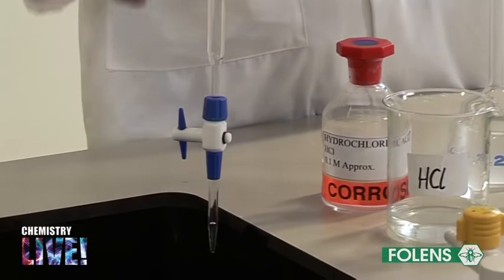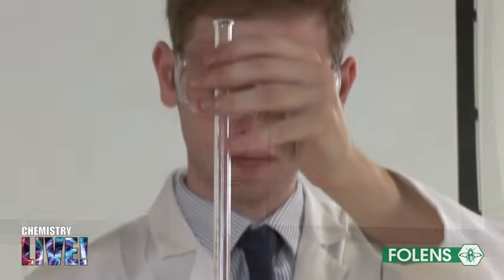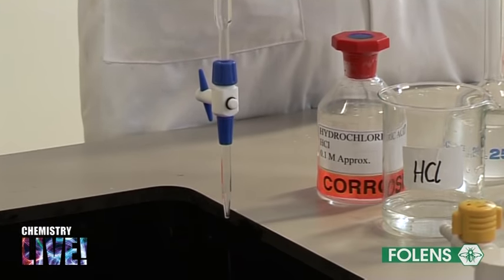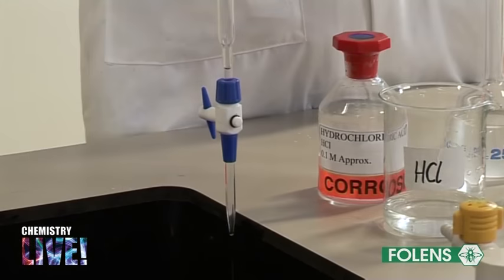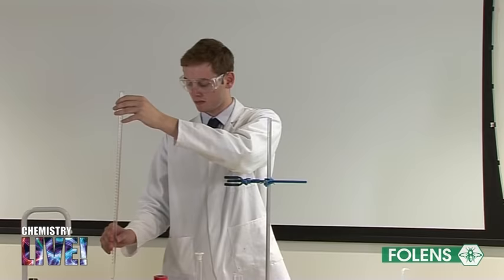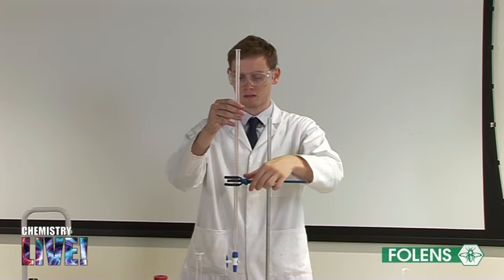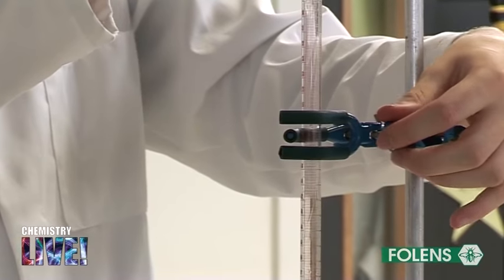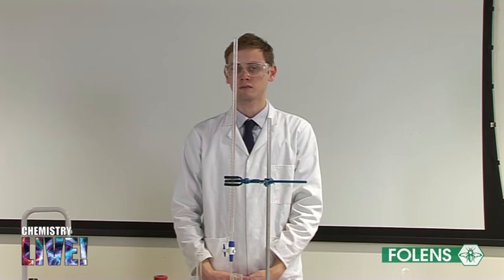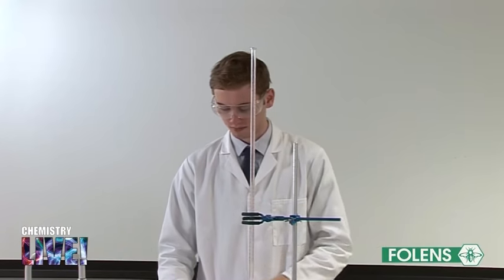Rinsing the glassware with the liquid that is to be used in them is necessary in order to remove any drops of water. This water would dilute the solution placed in the glassware. We have now finished rinsing out the burette and the pipette with the solutions that they will contain. In the third part of the experiment, pipette 25 centimeters cubed of the sodium carbonate solution into a conical flask.